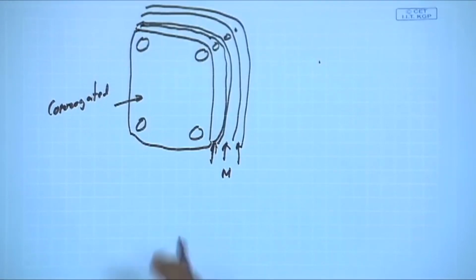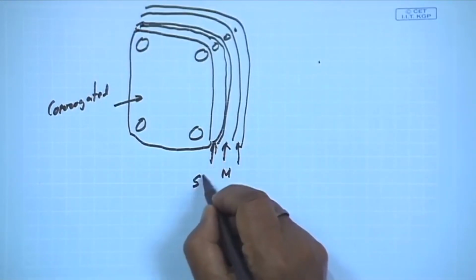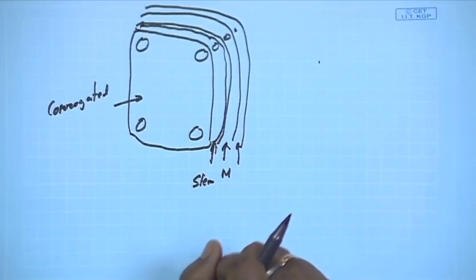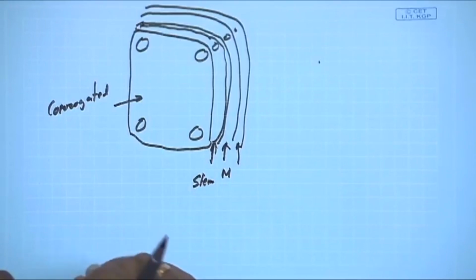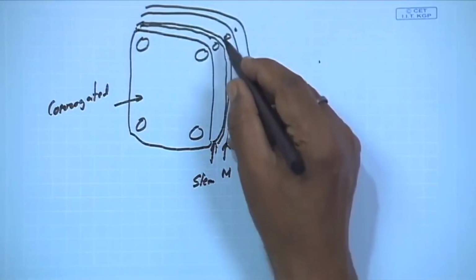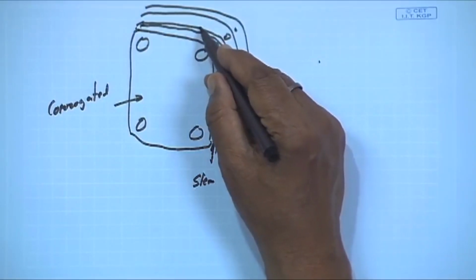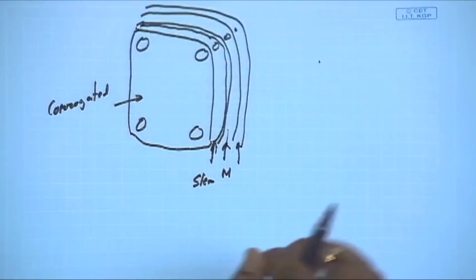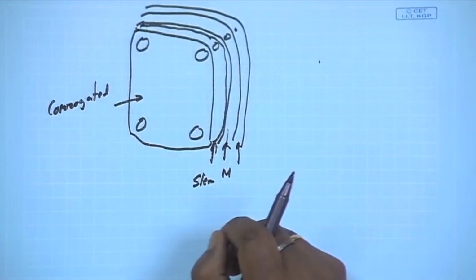And since suppose we are using the steam at very high pressure, there is every possibility that when you pass the steam at a high pressure, the gasket may burst. And if the gasket bursts, then there is some steam leaking. Suppose in between when you pass your liquid, if some leakage in the gasket is there, some kind of cracking in the gasket is there, then also your media can go out. Those kind of problems that we have.